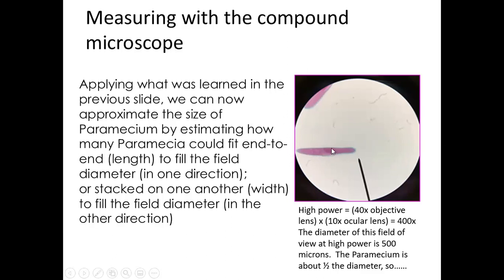Now, how wide is he? Might be a little bit trickier, but let's just say you could stack 10 of him high. So if I know that this diameter is 500 micrometers, then a tenth of that would be 50. So he's probably around 50 micrometers wide and 250 micrometers long, okay? That's a rough estimate, all right?